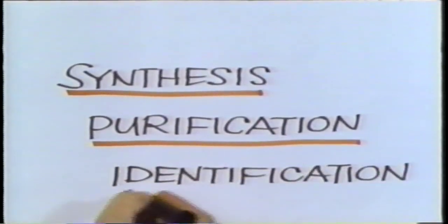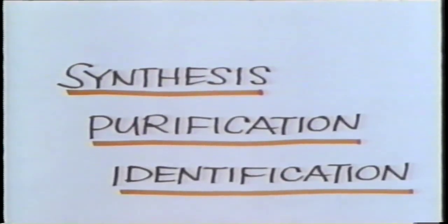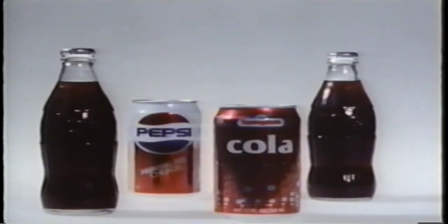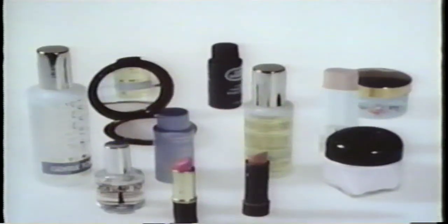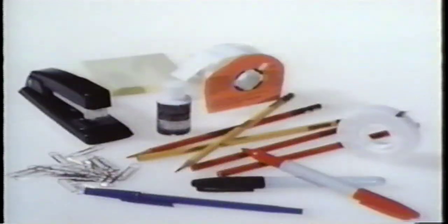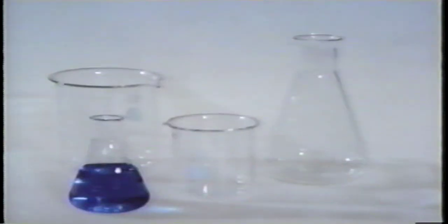These are the key steps in creating new compounds for scientific study and for practical application. Almost everything you buy, colas, burgers, calculators, plastics, medicines, cosmetics, clothing, and many other things result from the processes of synthesis, purification, and identification.